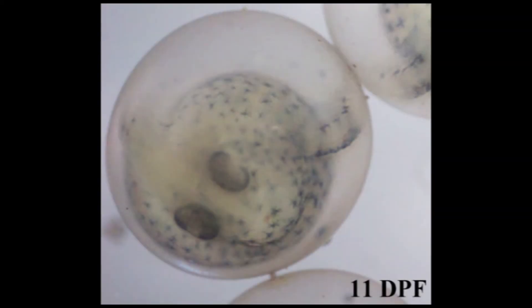At 11 days post-fertilization, the eyes of the fish are becoming dark and can be seen with a naked eye. This is referred to as the eye up stage.